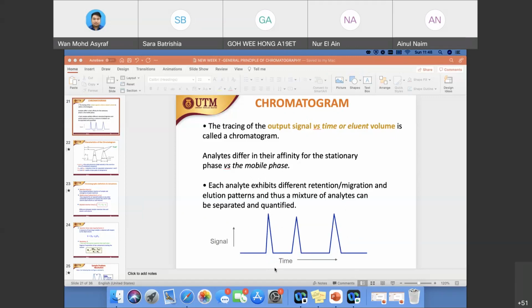So my job here is done. All right. So basically, when you look at the chromatogram, the first peak that comes out, which has the lowest time, the shortest time, is the one that elutes first, meaning it has the lowest interaction with your stationary phase because it just follows your mobile phase.